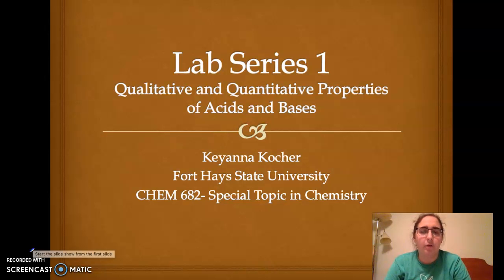This is my video for Lab Series 1. There are two separate labs in this series. The first one is a qualitative analysis of acids and bases. So the students will look at different observable qualities of household items. And then the second lab is a quantitative analysis of acids and bases. So they'll be more focused on the pH.